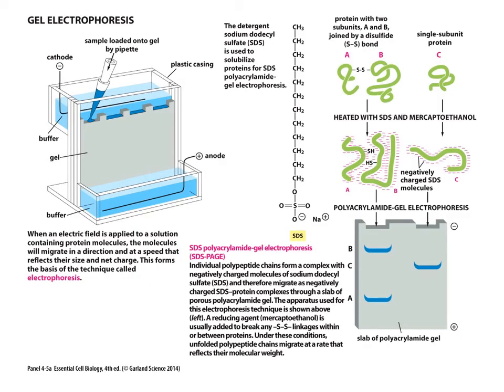Here's a picture of our apparatus again. We can imagine this gel being loaded. We've talked about the SDS, we've talked about the disulfides, and now we need to look at the actual running of the gel, using pictures from Bio-Rad and other people to show you what it would really look like if you were going to do it.